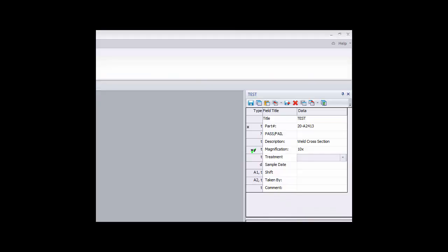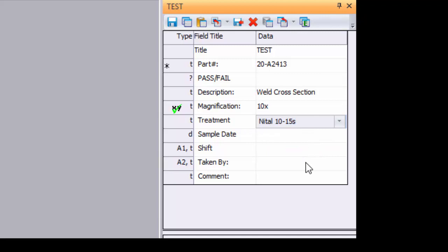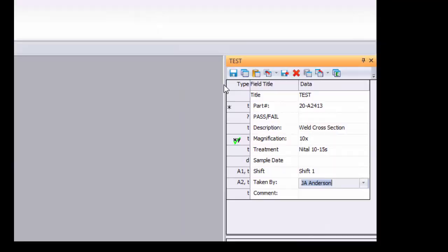Lookup tables are designated in the next column. A lookup table is simply a drop down list of entries for users to choose from when they go to fill data into this field. A drop down list of choices can aid the workflow by keeping people consistent in their entries and keeping them spelling words correctly. It also narrows the choices to only those things in the list so spurious entries are avoided.